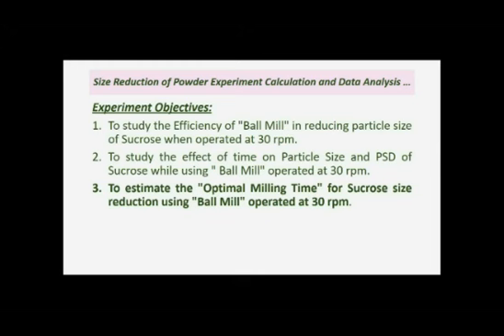Determine particle size interval lower limits. Particle size interval lower limits are the point at which each interval starts, while particle size interval upper limits are the end of each particle size interval.